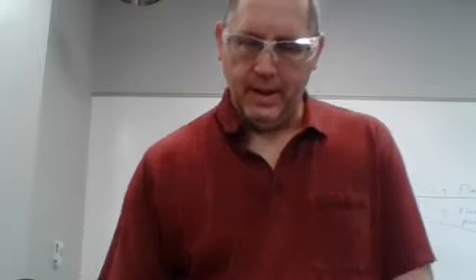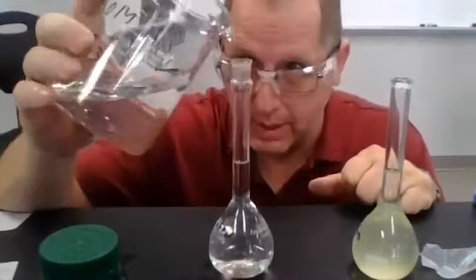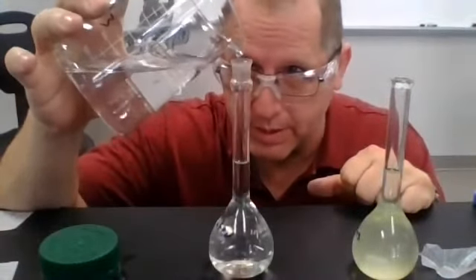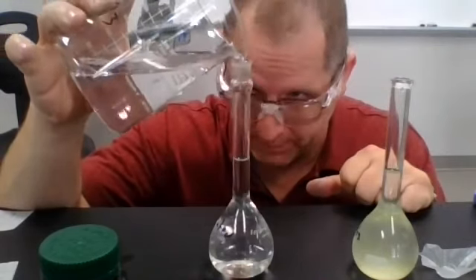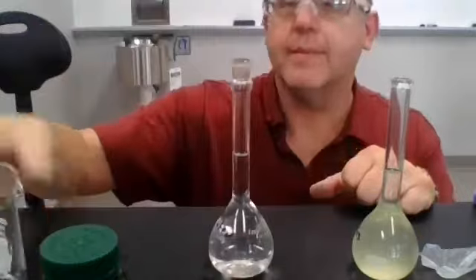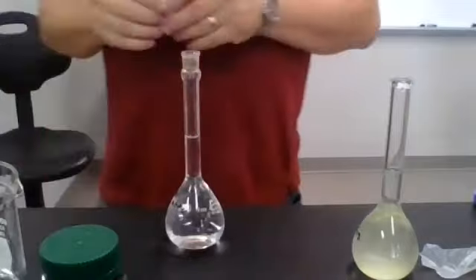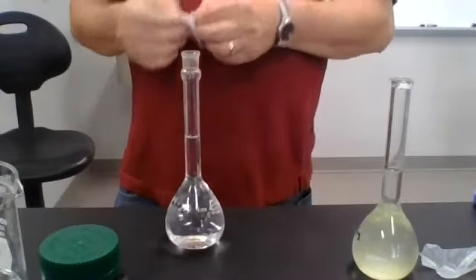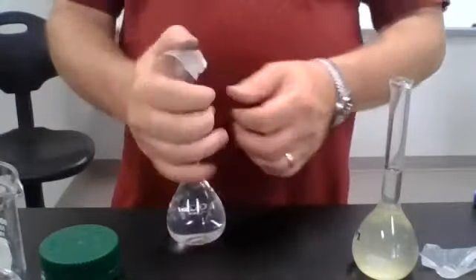And let's see how good I am with this one. I guess I put it to where you can't see it. I will again bring it here. Let's see how good I am. Should I go over a little bit just for fun here? Okay, so that's pretty good. Not perfect. Again, I'm trying to give you real data. So if you do an analysis of this lab, you might notice, oh, hey, this isn't going to be perfect. Mixing this up well.